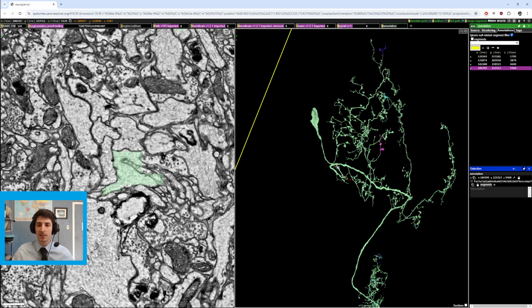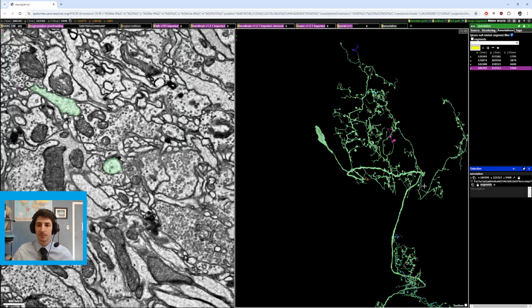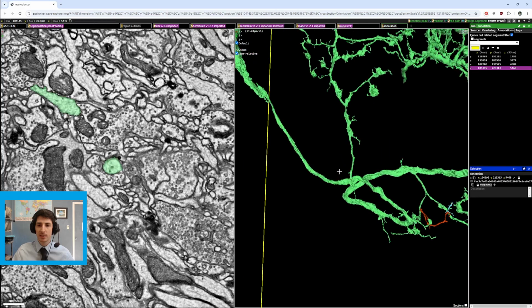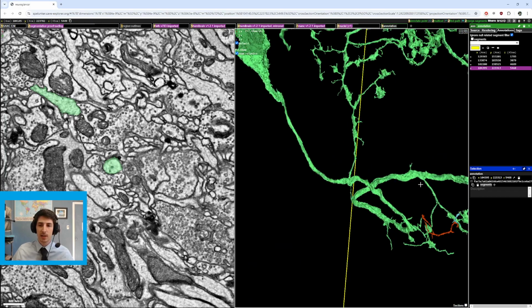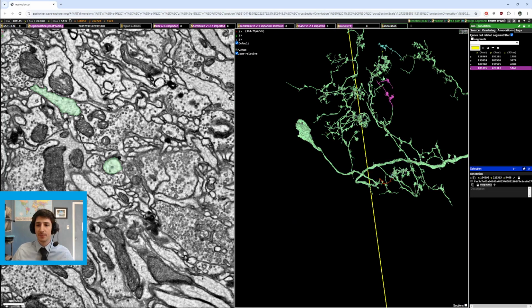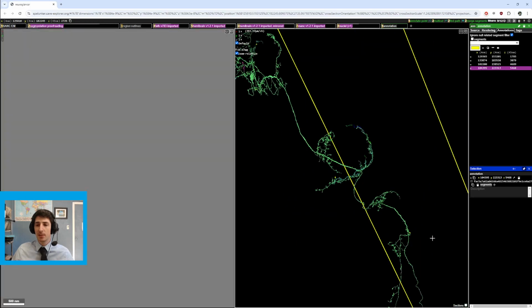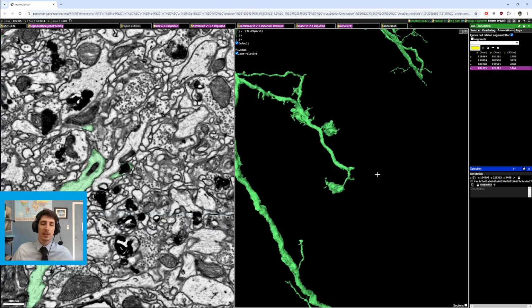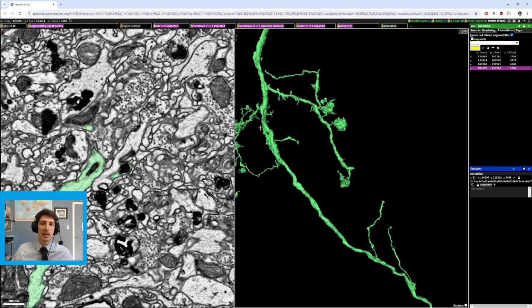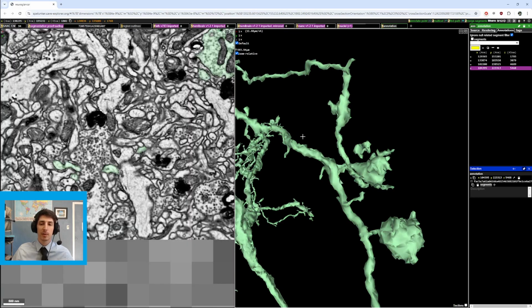This one, it'd probably be hard to tell if you only had this as a reference, but it's always good to check these perpendicular connections. Usually it's offset, so it would be connected like this or it'd be connected like that, but a one-to-one perpendicular connection is suspicious in its own right, so bear that in mind. And so you could use the general length of branches to give yourself information as to where best to put your time in for proofreading.